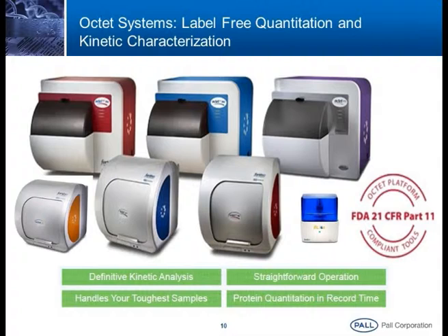Okay. This is an 8 channel instrument, which I brought here. At a time you can run 8 samples. You can finish off kinetics or quantitation studies. Say suppose in quantitation, you are expressing proteins and want to measure their concentration. So with this 8 channel instrument, we can measure 8 samples at a time. We can perform different dilutions in kinetics, from higher to lower dilutions, and we can conduct kinetic studies here.